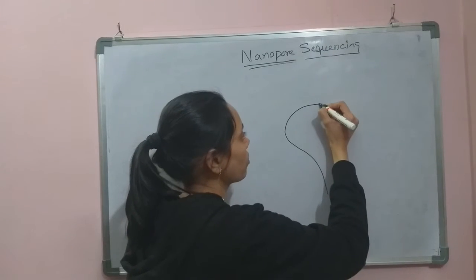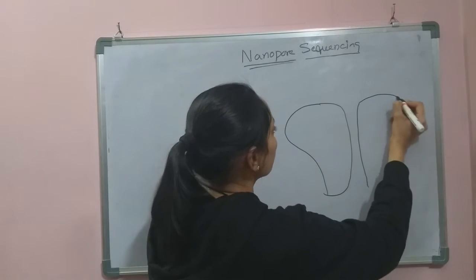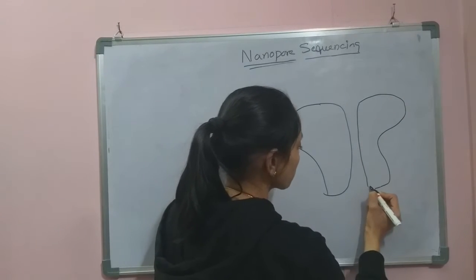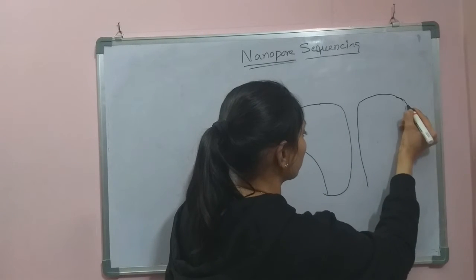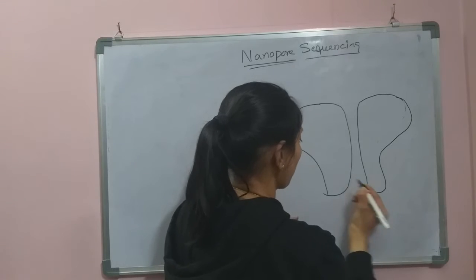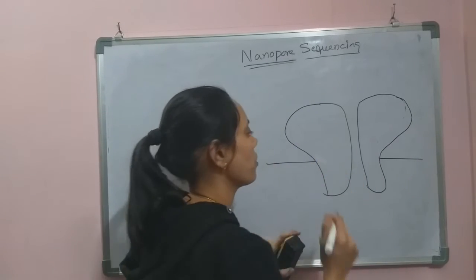Such membrane pores, or nanopores, which are very much small, are embedded in an electrically resistant membrane.